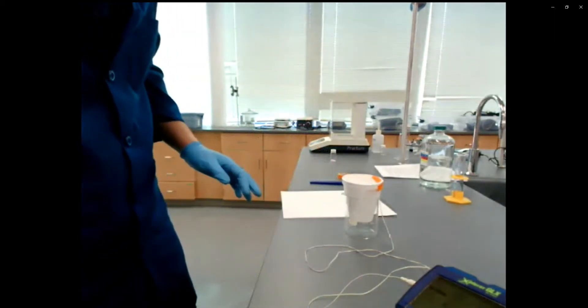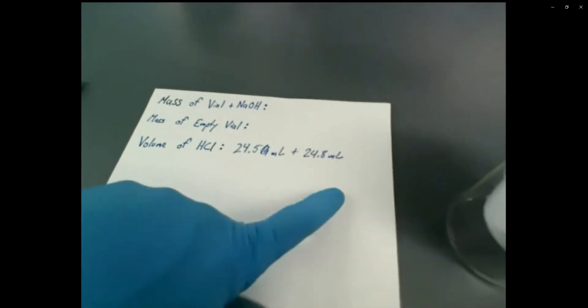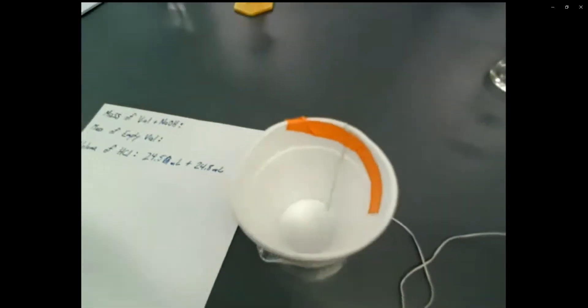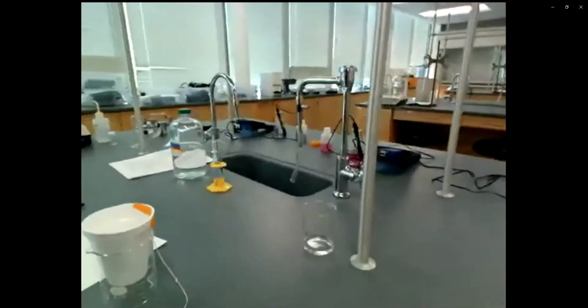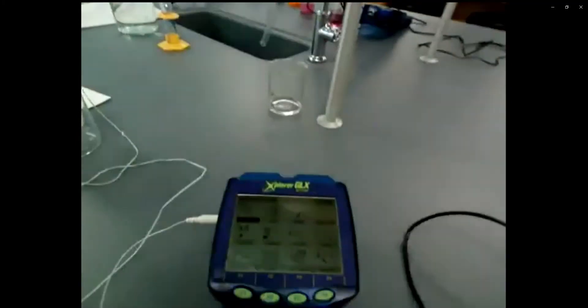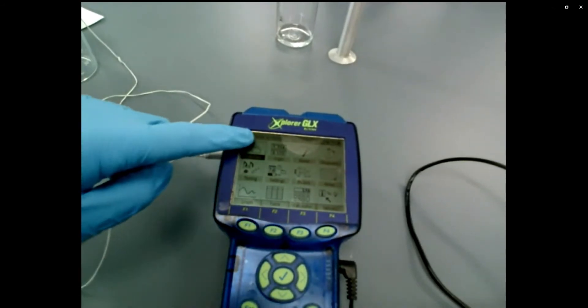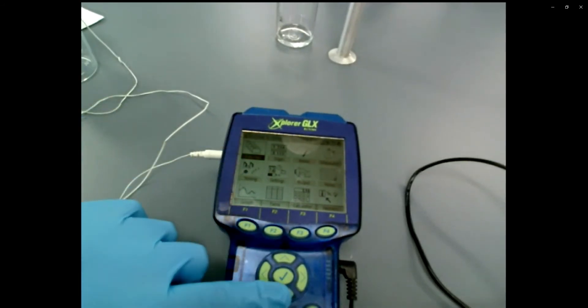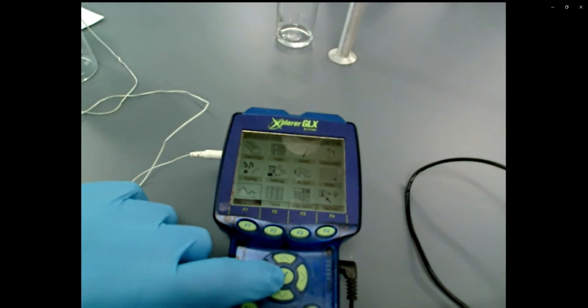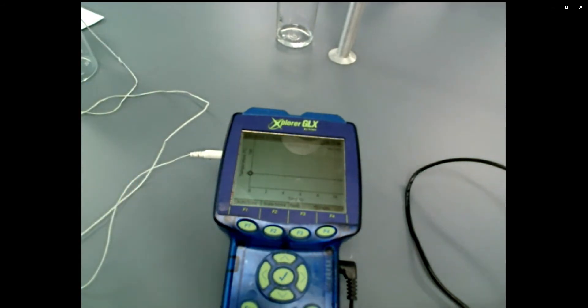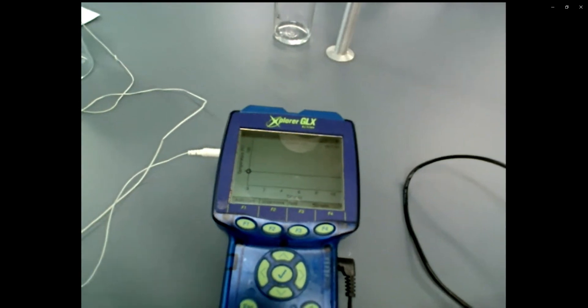So just to show you guys what I'm sort of writing down. I've got a volume of HCl. So the temperature probe is submerged in my hydrochloric acid. It's at the bottom of the cup. So now to set this up, what we want to view is the graph. So I'm going to scroll down a couple and hit the check mark to select it. And so here's a graph that will display temperature on the y-axis and time in seconds on the x-axis.